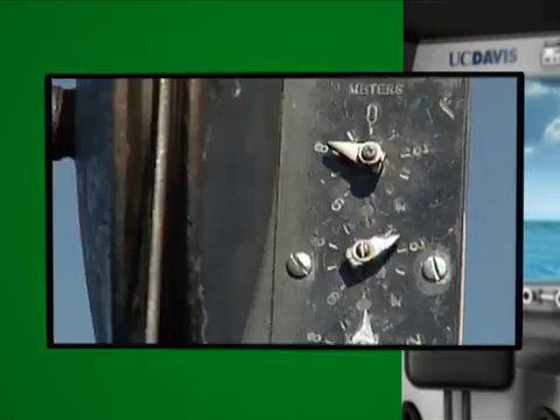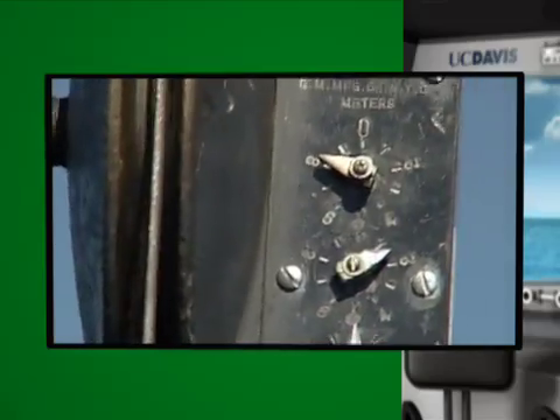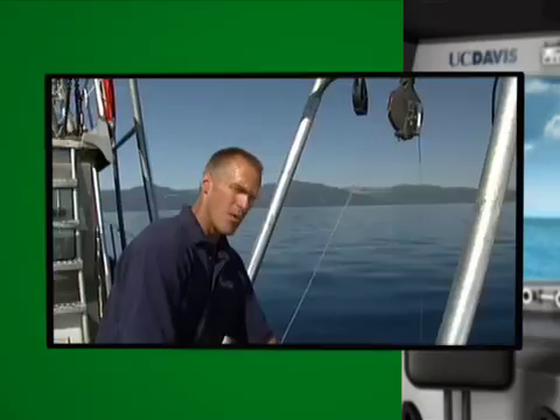If I look at the meter wheel, I'm at 18 meters, and that's a good reading for today — that's 59 feet. I'm going to go ahead and bring it back up, and we'll move on to some other tests.